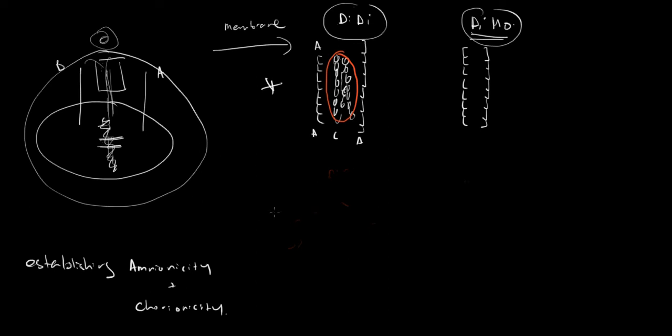And a T section, as we said, is a section where you're taking a section through the placenta just at the level of the dividing membranes. And so what you'll see is the territory of A, and then the dividing membranes come up, and then the territory of B. And then at issue is what you see in those dividing membranes. So if you see amniocytes on one side, amniocytes on the other, and a few vessels and chorion in between. So vessels plus chorion, that would be a di-di.